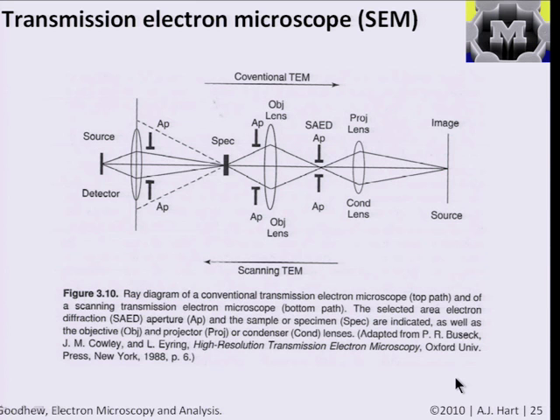And the difference in terms of the interaction with the material between TEM and SEM is, in a TEM, you're shooting the electron beam through the material and basically casting a shadow of the material when it's illuminated with the electron beam. And so now you have the same idea. You have an electron source emitting a beam of electrons, and you have a bunch of optics and apertures that let you do what you want with the beam to focus it down onto your sample. And you have, in this case, optics both before your specimen and after your specimen, and then by operating those in the right way, you then collect an image on a screen far down the column.